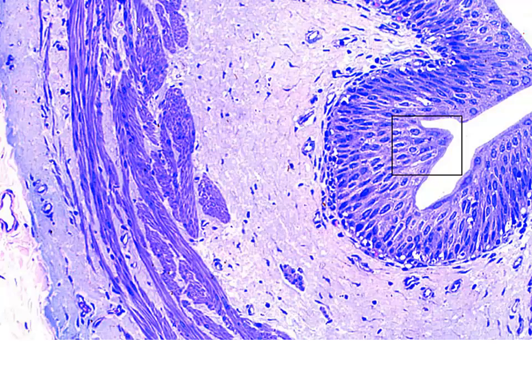Look a little bit more closely. Here we can see our mucosa. This is going to be transitional epithelium. It's fairly flattened at this point. There we might have a binucleated cell, but this is transitional epithelium, submucosa, muscularis, adventitia out here.